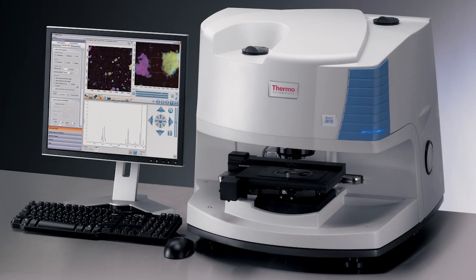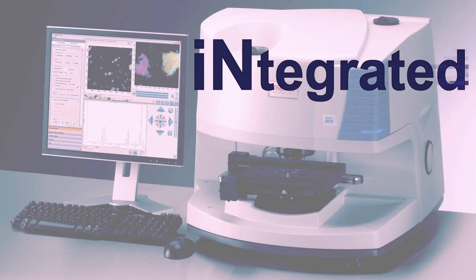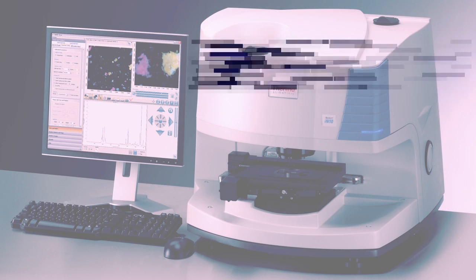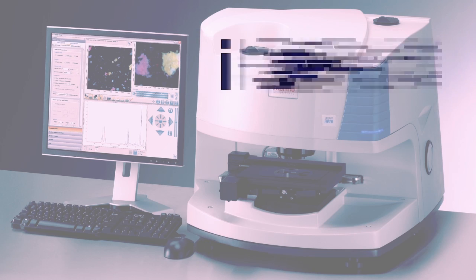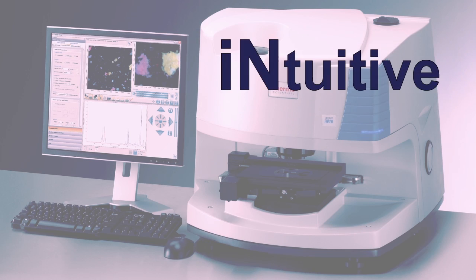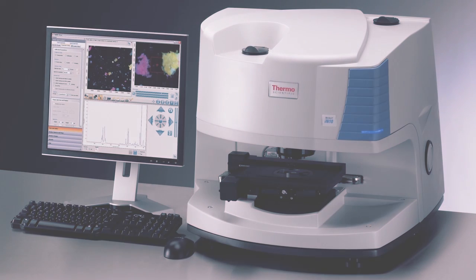Welcome to the Thermo Scientific Nicolet IN-10 microscope, the integrated, innovative, and intuitive FTIR microscope system for today's laboratory.